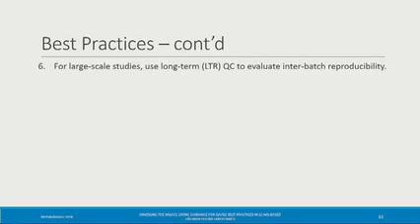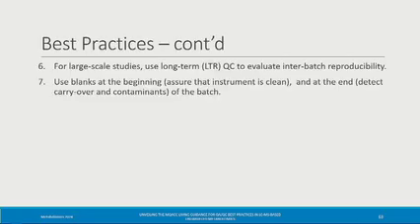Continuing along, for large-scale studies, we need some kind of long-term QC that lets us evaluate inter-batch reproducibility. This is particularly important for longitudinal studies with thousands of samples spanning many, many years of sample collection, et cetera.